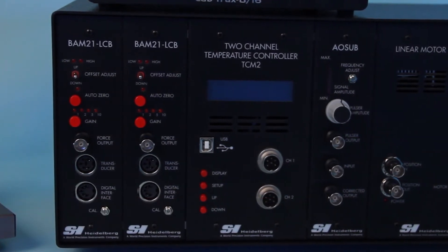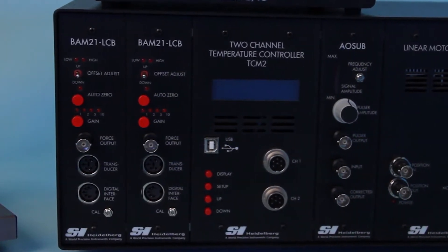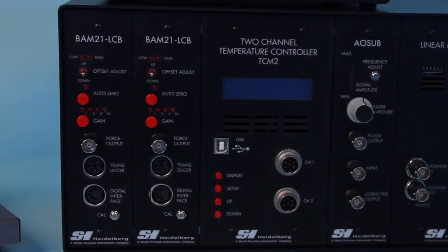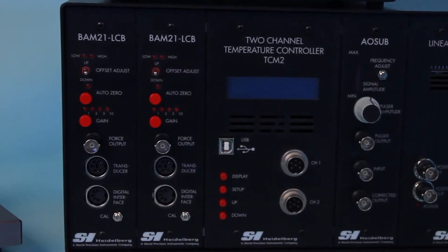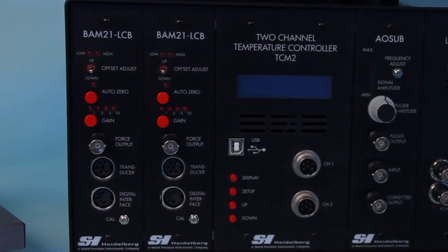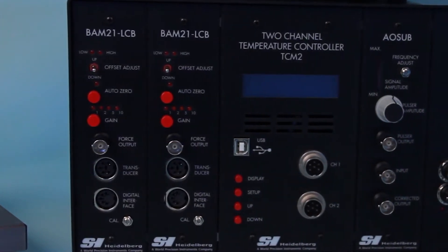If the standalone version of these units are used, they must be connected externally so that the output of the BAM21-LCB is connected to the input of the anti-oscillation unit. In both cases, the output of the anti-oscillation module is a transducer signal that needs to be recorded.